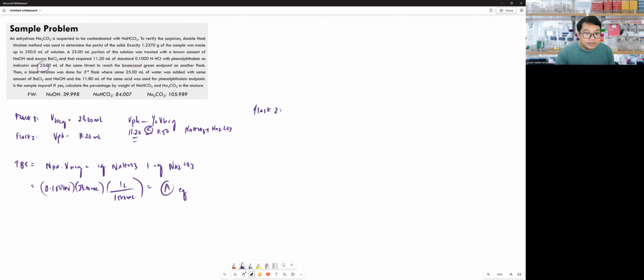So our HCO3 minus and CO3 2 minus, as you add your NaOH, it converts your bicarb to CO3. Then you have excess OH minus. This is the total. Okay? Then you added barium chloride. So all of our carbonate will become barium carbonate. Then our excess OH is still there. Then that excess OH is what we will titrate with VPH.